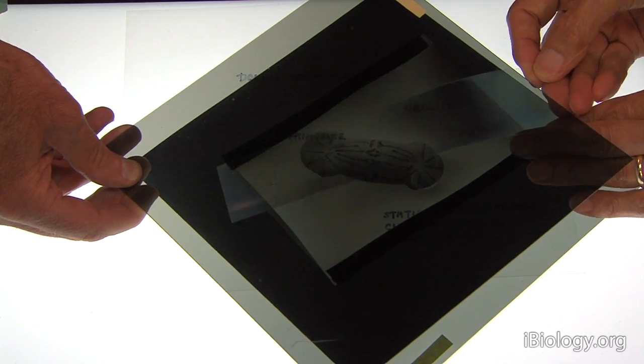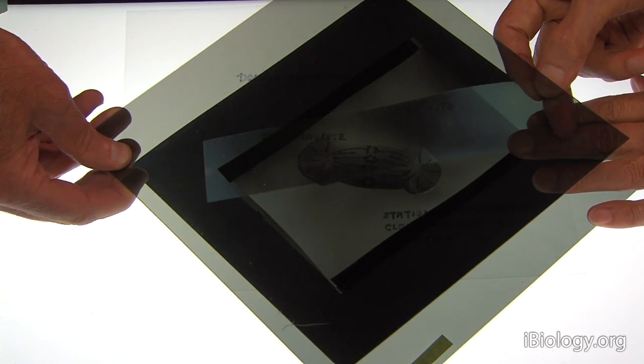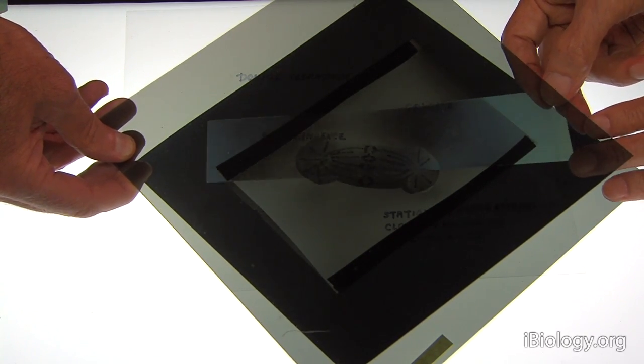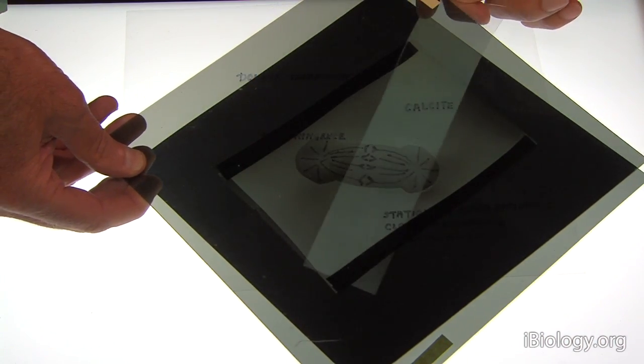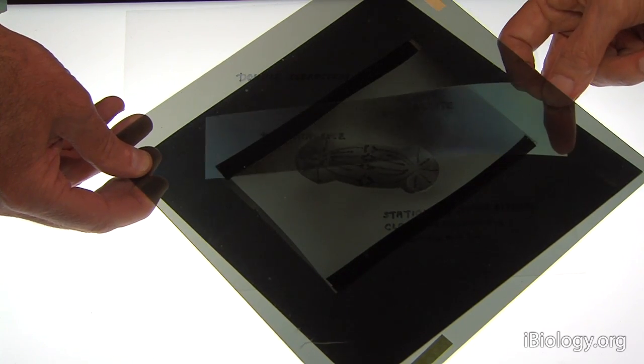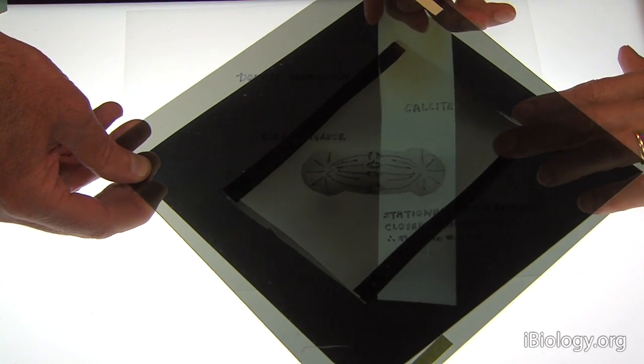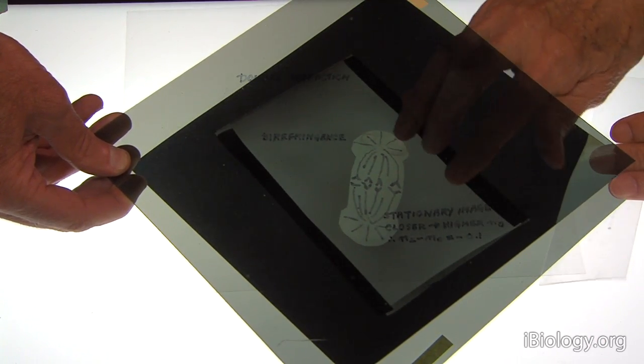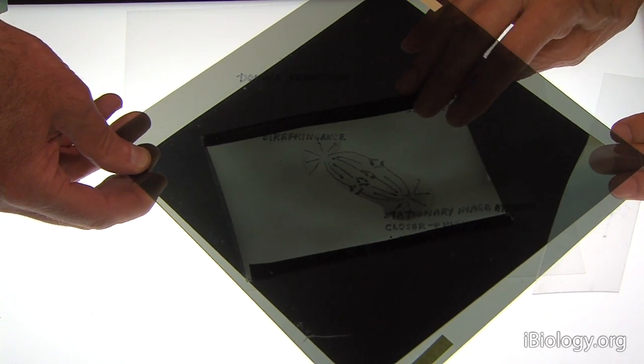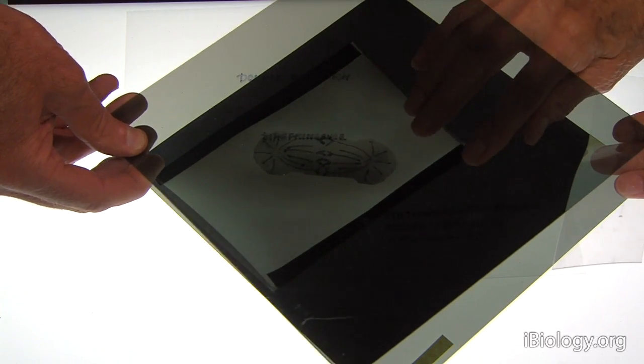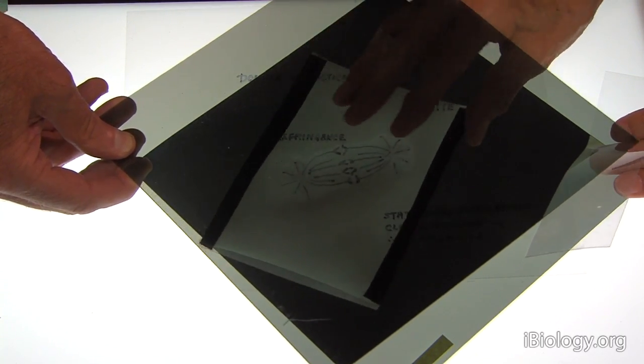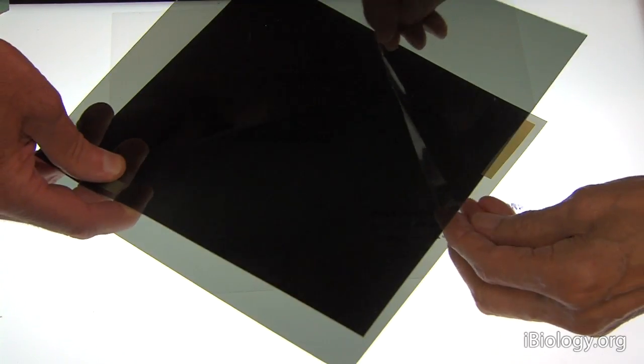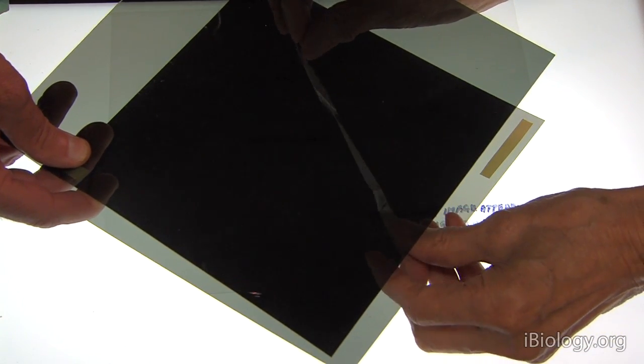So this is a model of a mitotic spindle which is weakly birefringent. In fact, the birefringence is only a few hundredths or thousandths of the birefringence of the calcite crystal you saw. So we need this compensator in order to see which way the molecules are lined up and how the birefringent material itself behaves, just like the calcite crystal, depending on the orientation of the material.